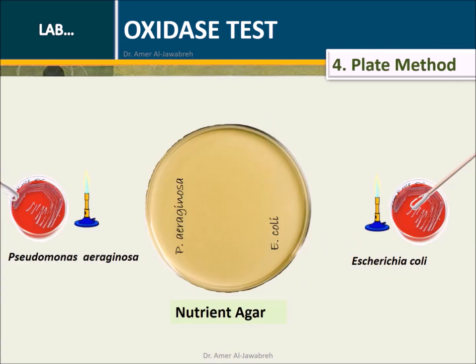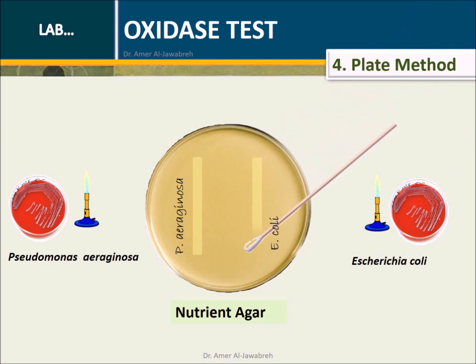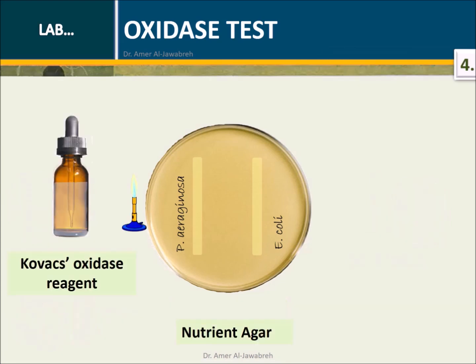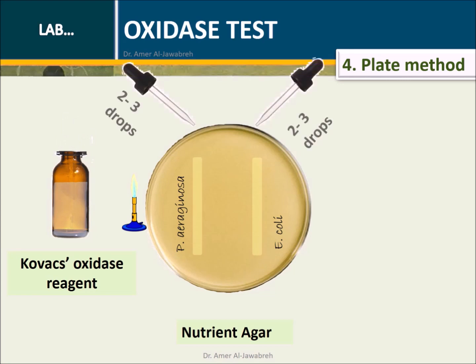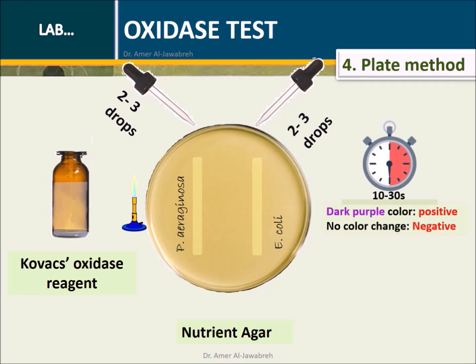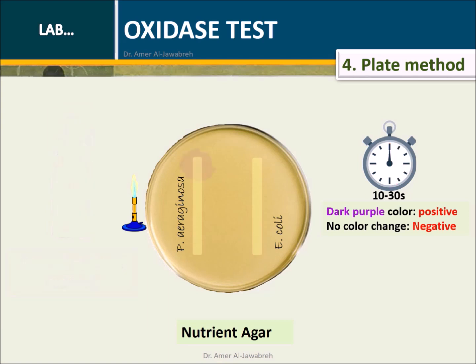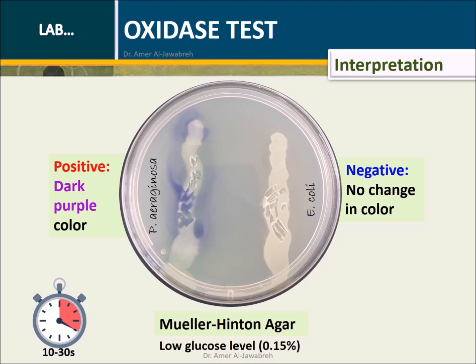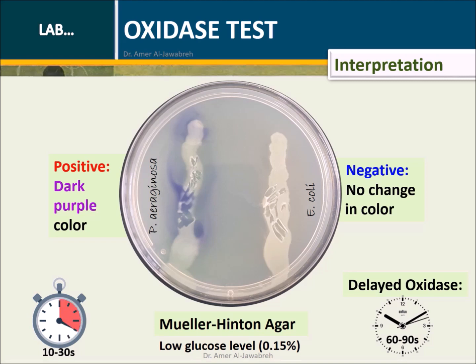Method 4 — Plate method: From a blood agar plate, take a swab of Pseudomonas aeruginosa and draw a line on one side of the nutrient agar plate. With another swab, draw an E. coli line on the other side. Incubate at 35 to 37 degrees centigrade for 24 hours. Add 2 to 3 drops of fresh Kovacs reagent directly to the suspect colonies on the agar plate. Do not flood the plate with reagent. Observe for color change within 10 to 30 seconds. Dark purple within 30 seconds indicates positive results; no color change indicates negative results. Note: delayed oxidase positive on plate method can be within 60 to 90 seconds.